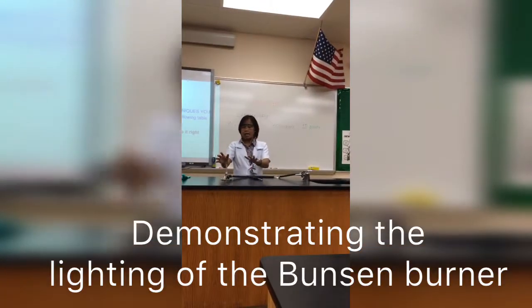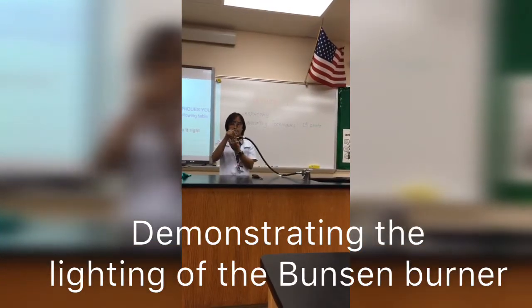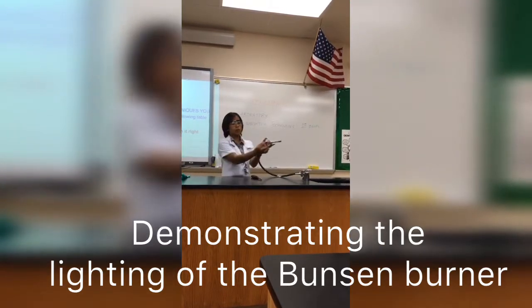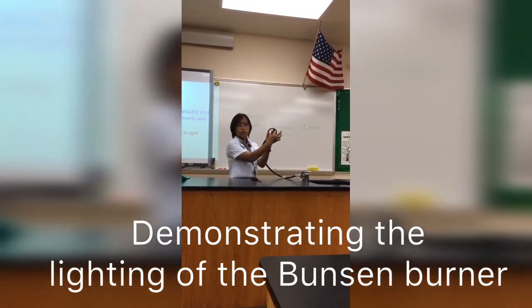So this is the Bunsen burner. The parts of the Bunsen burner are basic. This is the base, and then the one at the bottom — this one at the center is your control for the gas.